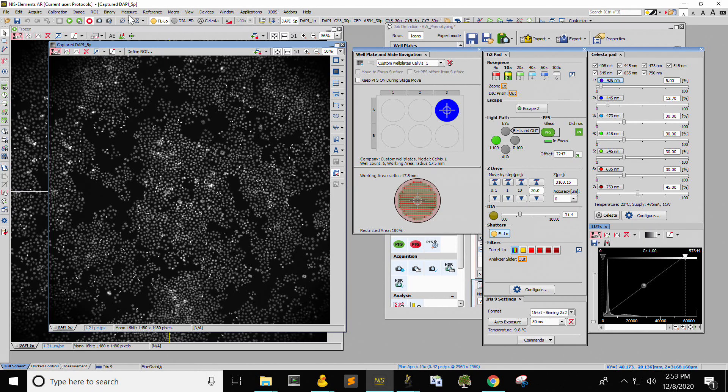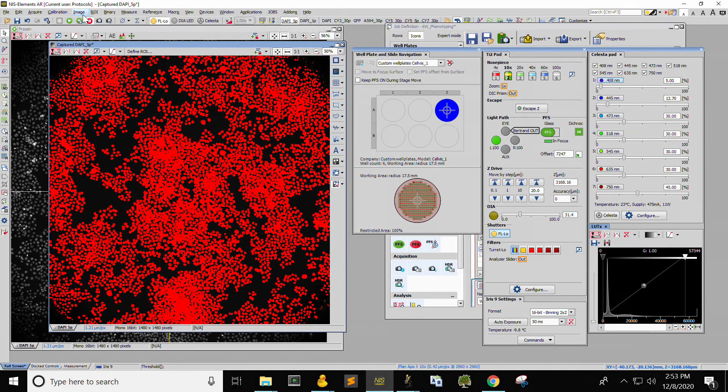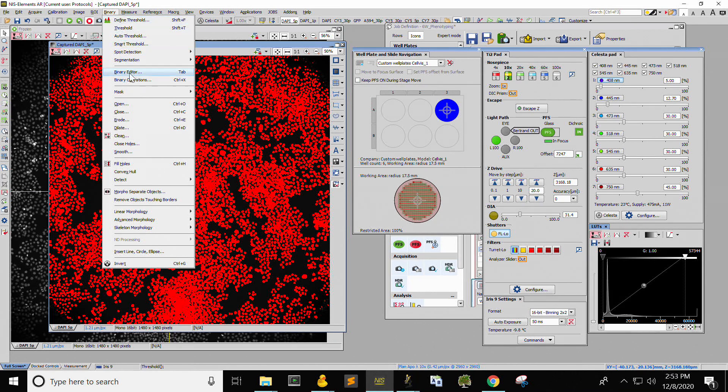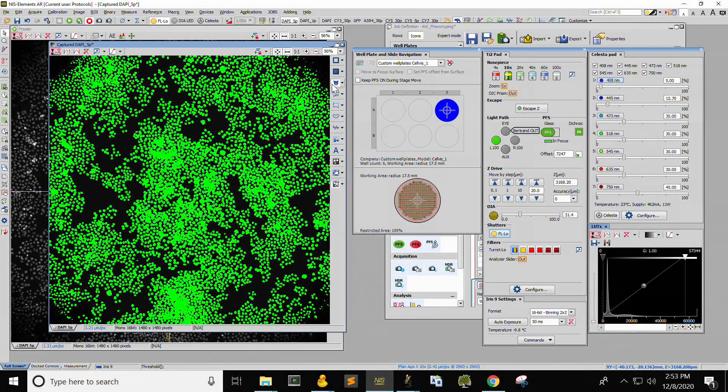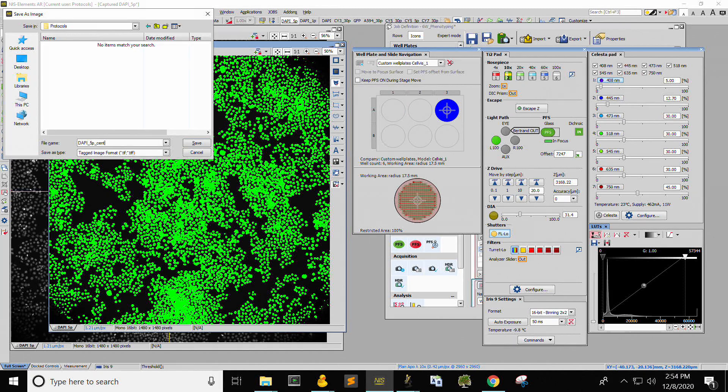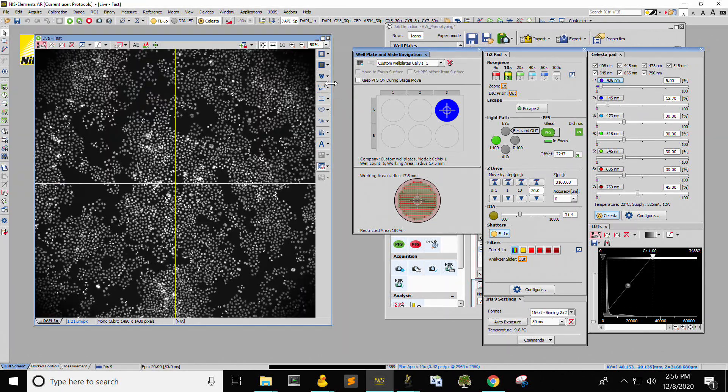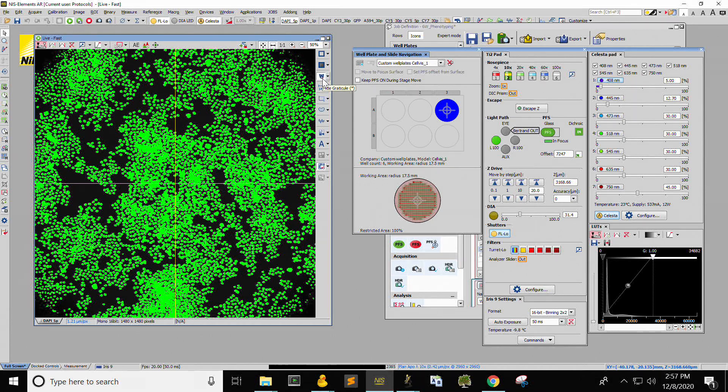For subsequent rounds, align by creating a mask from the center image of the DAPI channel of first round data. This can be done by loading the image and using the DefineThreshold, then DefineMaskByThreshold functions to mark the nuclei. Save the mask and load it when imaging the next round of data. While on live view, move the sample until the current DAPI image overlaps with the first round. Then, create an SPS job that uses center point alignment to perform all other acquisitions.